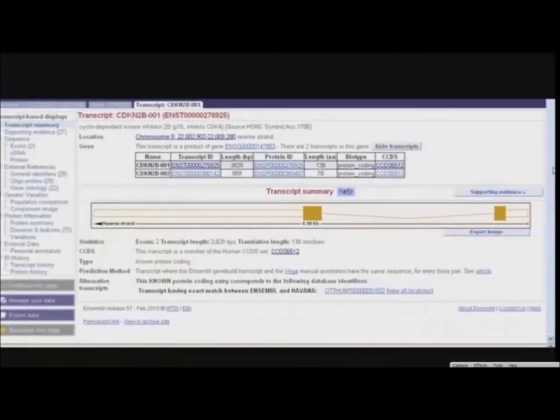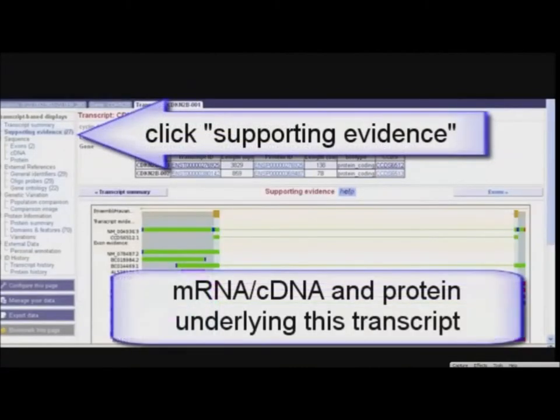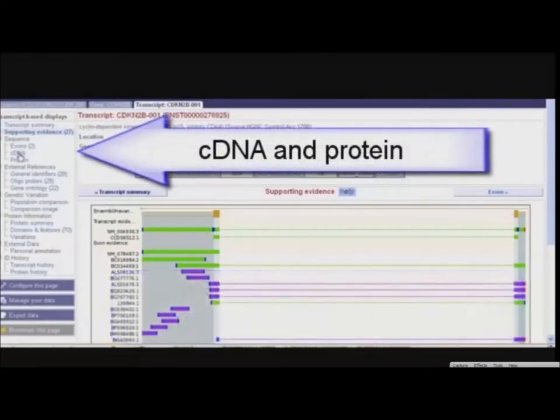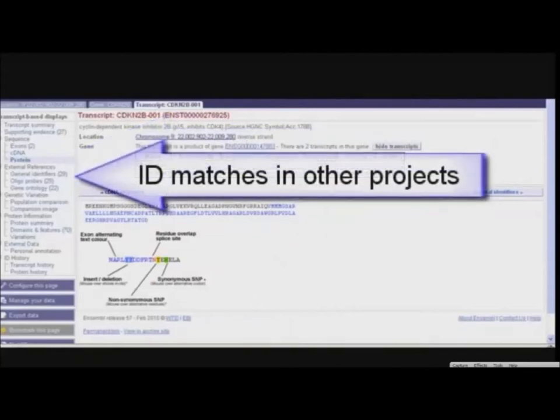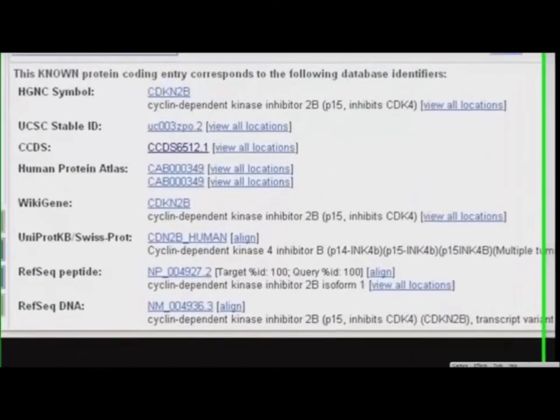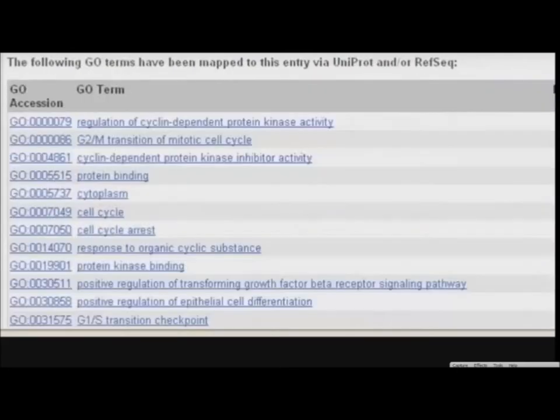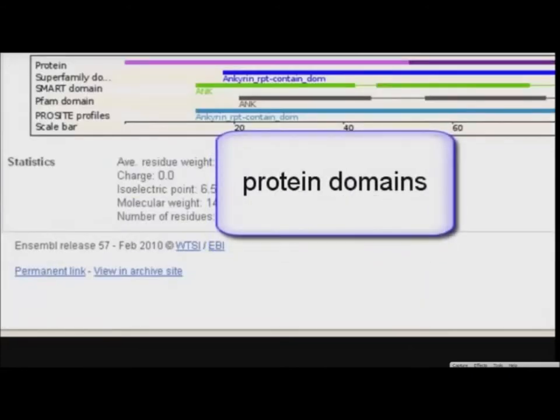We are now in the transcript tab. At the left, links to the supporting evidence — sequences on which this transcript was based — sequence displays, introns and exons, cDNA sequence, are available. Other links include general identifiers. Here we see matches to the Ensembl gene or protein sequence in other databases, such as Uniprot. We have matches to oligoprobes and gene ontology terms, which provide functional classes assigned to the protein or regions in the cell. You can even find different protein domains mapped to the amino acid sequence.